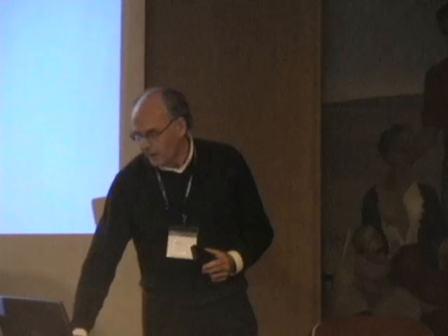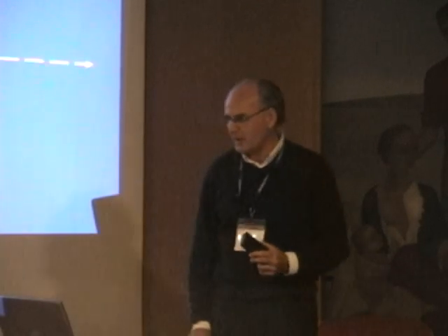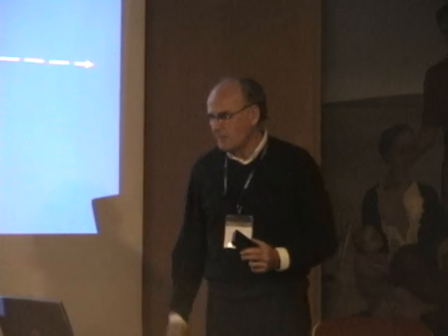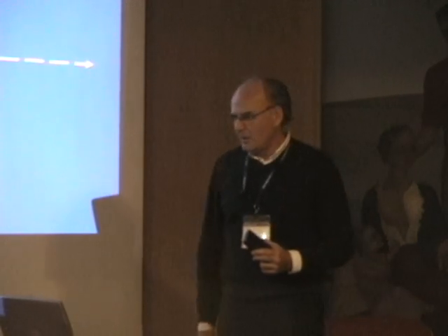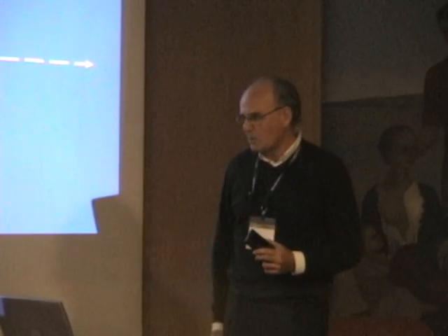If we look at the range between the two red vertical lines, we forget about what's to the left and to the right, we see in vivo maybe 3.5 peaks, or maybe even 4.5, and if you increase the field, maybe 1 or 2 more peaks, but that's about it for this spectral region.